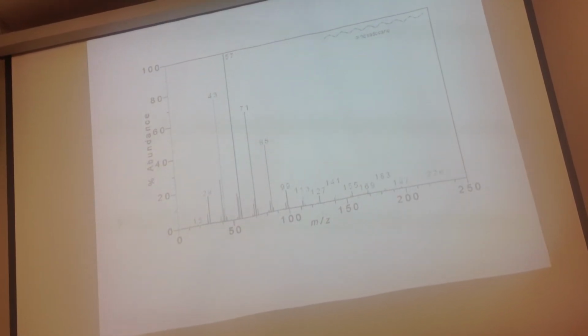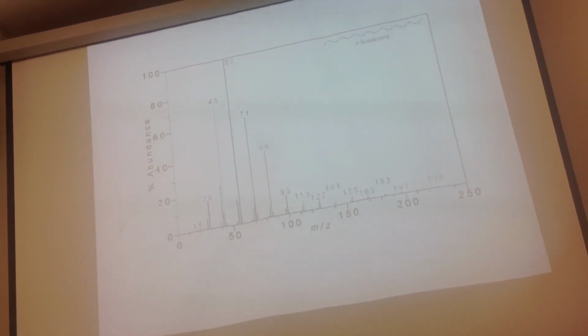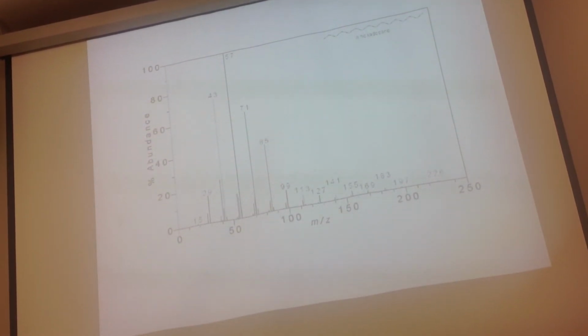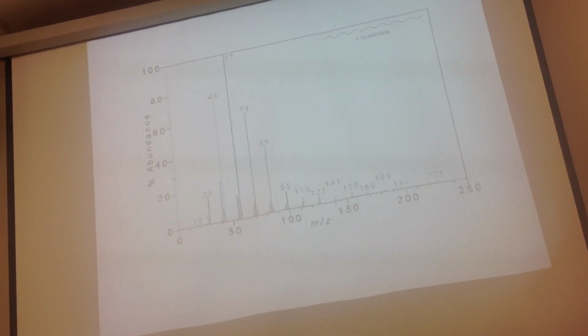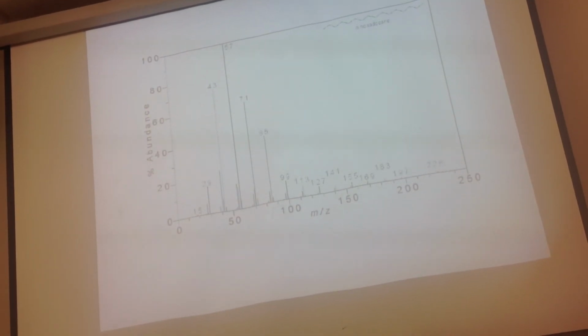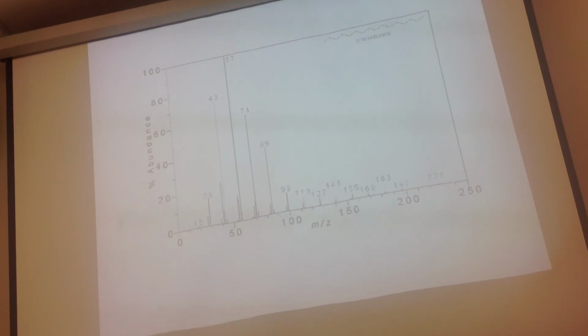Okay. You mentioned that methane as a carbocation was unstable, but it seems like in this graph that even a 15 carbon chain that's a carbocation is not stable, or less stable. It showed up, the CH3 plus. Right, yeah, that shows up there, but why is it that if you have a 15 carbon carbocation, why isn't that stable enough to show up?